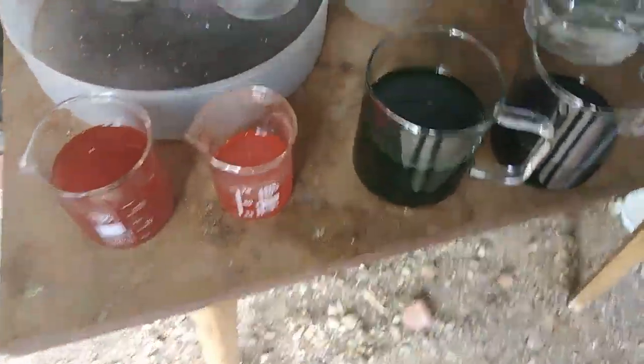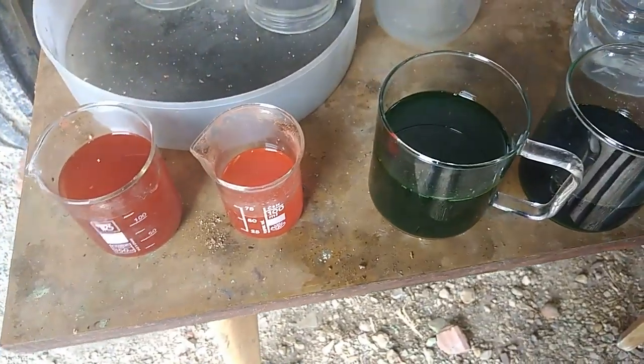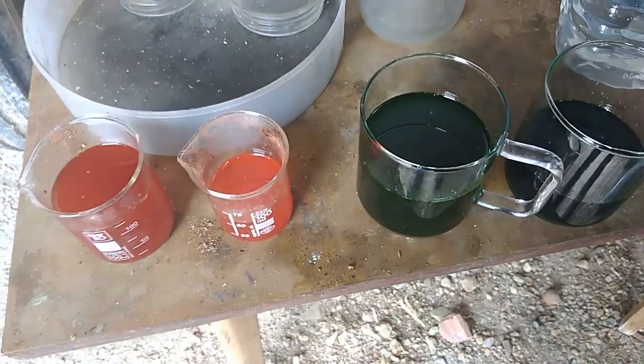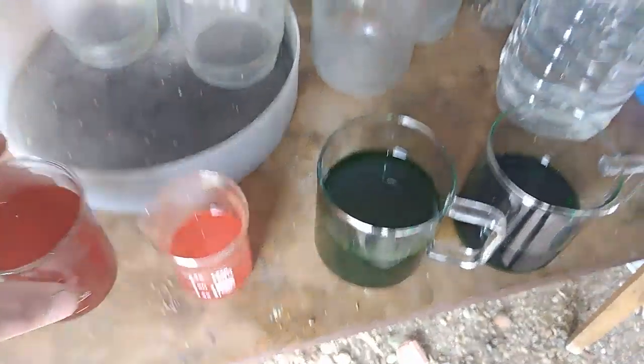Hey guys, after maybe a half hour, I can see these two solutions have still not fully settled down. But if you look at the bottom, I have some deposit — a very, very small deposit, but not bad.